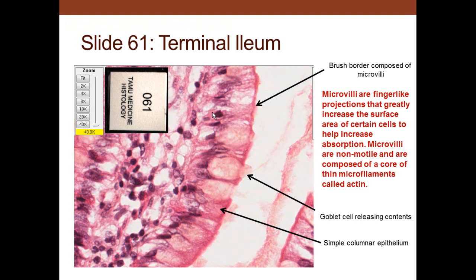In the terminal ileum, we see a brush border with microvilli projecting into the lumen, and terminal bars at the cell junctions. Microvilli are finger-like projections that greatly increase the surface area for absorption. They are non-motile, composed of actin microfilaments. In the intestine we see goblet cells and intestinal absorptive cells — the absorptive cells have a brush border of uniform-sized microvilli, while goblet cells also have microvilli but the brush border cells have the most uniform size.